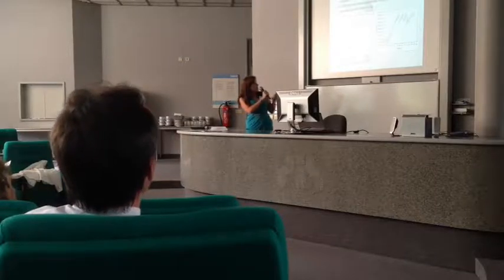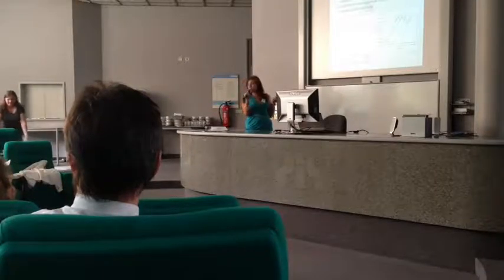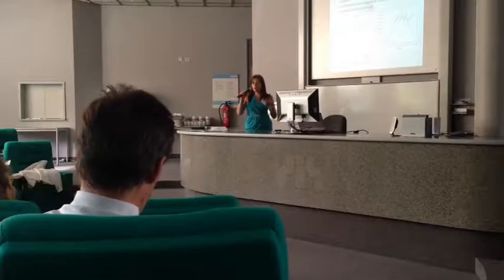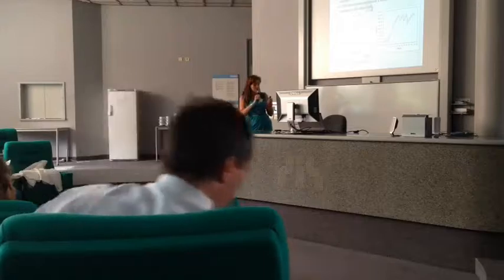So the culture grows quite well on this slide, with a little bit of lag phase of adaptation to the high light. We did this on batch culture first. When the culture reached 40 million cells per milliliter, we started to partially harvest the reactor and replace the nutrients, and see how these changes in nutrients are reflected in the photophysiological response.